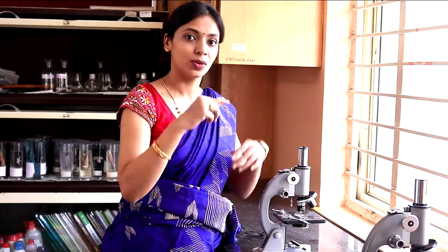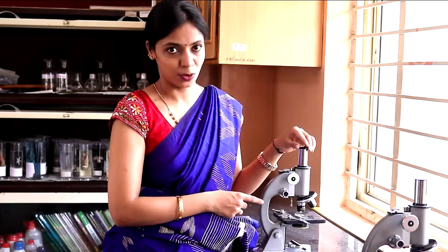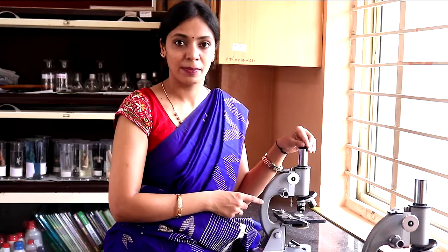Okay, so I will tell you what you can use as a clue to identify this slide when it is given to you in the exams. The micropyle, the pore. I told you that the 2 integuments do not completely cover the ovule, right? So there is a small opening that is called the micropyle. By making use of this, you can identify the micropyle first. Once you see the micropyle like a small slit there, you will be able to identify this slide as the vertical section of megasporangium or the ovule. Again, it's very important for you to remember to mention that it is a vertical section. If you just write megasporangium or the ovule, it will not fetch you any marks.